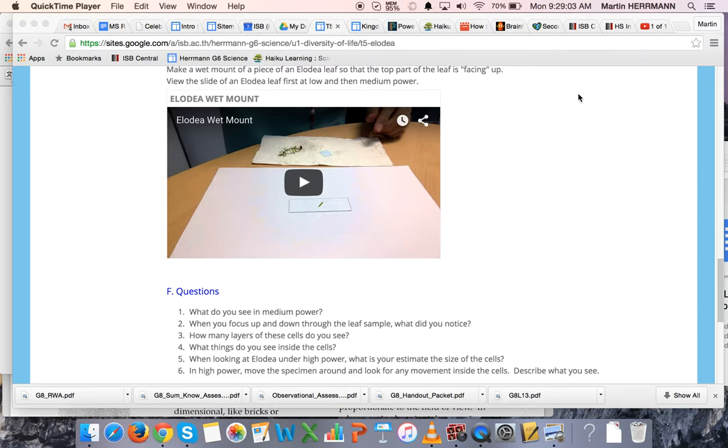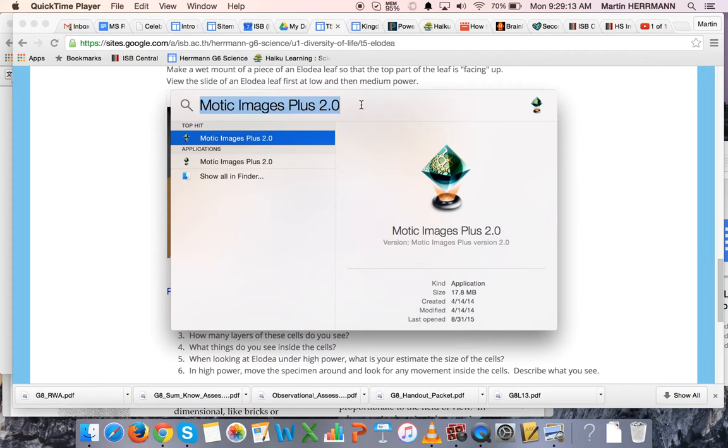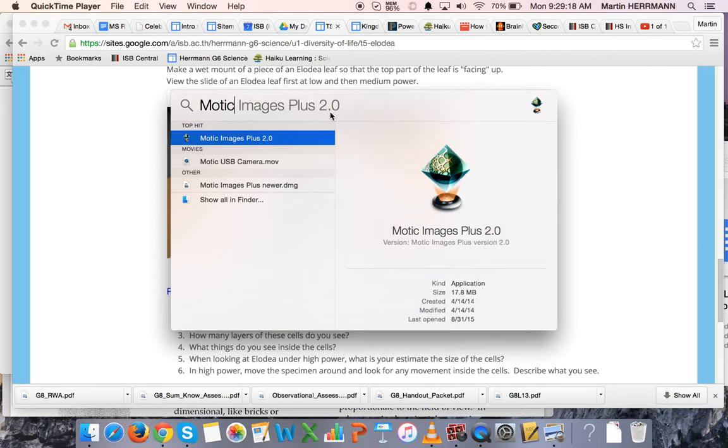Next thing you need to do is find the software on your computer that you can use to see the image of the Elodia leaf. To do that, go to Spotlight and type in the word Motic. As you type in the word Motic you should get an application called Motic Images Plus.